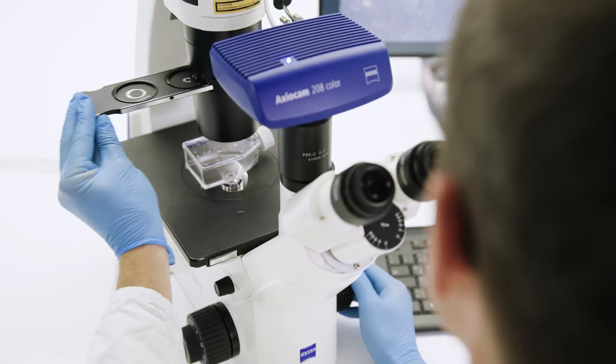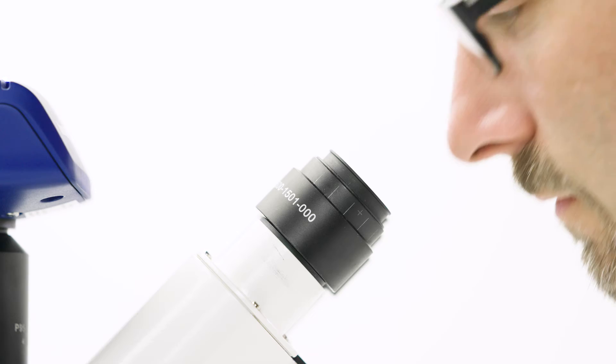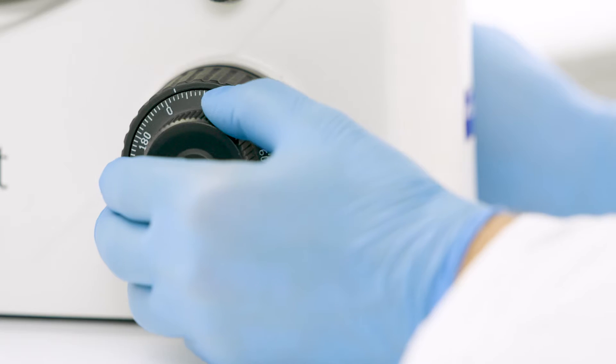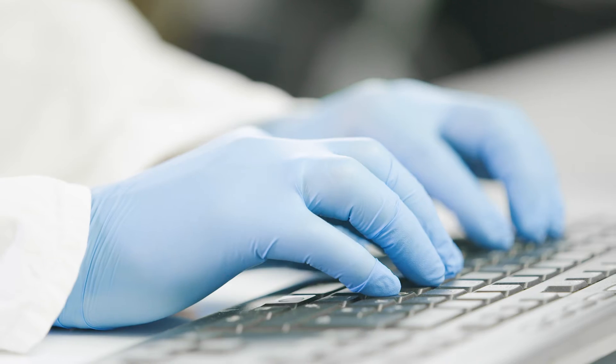Do you work in a cell culture lab? Then you're probably familiar with the task of cell counting. The number of cells is one of your critical values to decide on cell proliferation and viability.